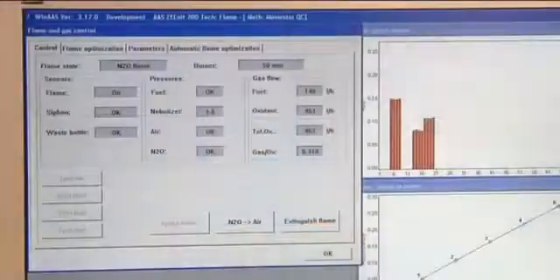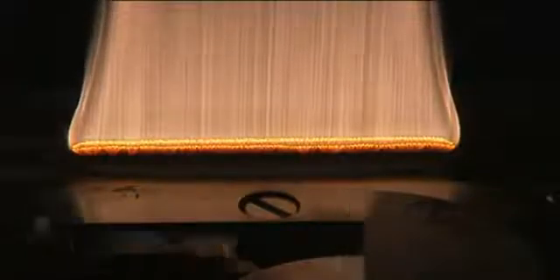The well thought out safety concept ensures trouble-free work. Sensors monitor all components of the instrument and provide reliability and automatic operation. An automatic scraper removes soot deposits from the burner slot when the acetylene nitrous oxide flame is used.